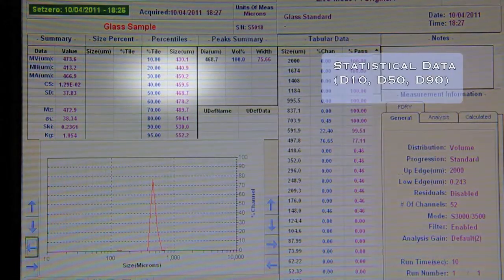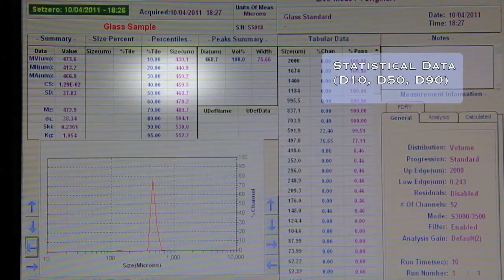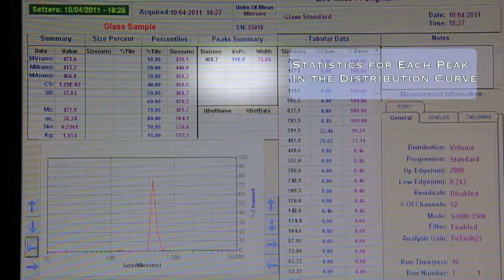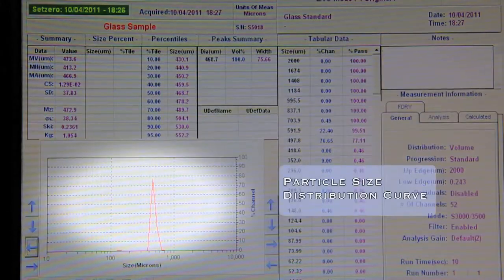It also shows information such as D10, D50, D90, information on each peak, as well as the particle size distribution curve.